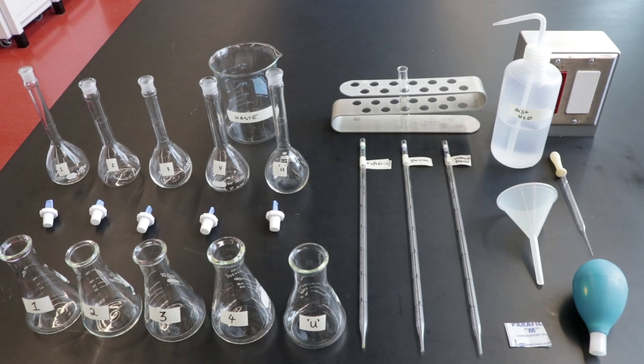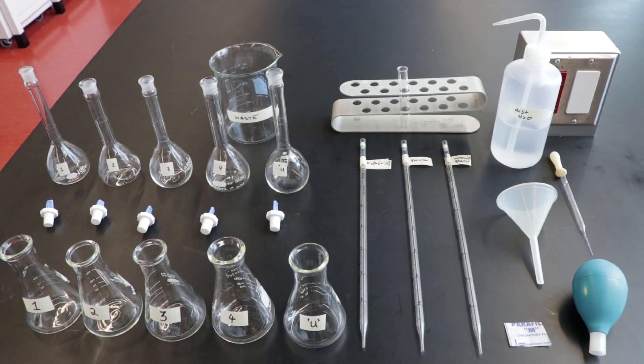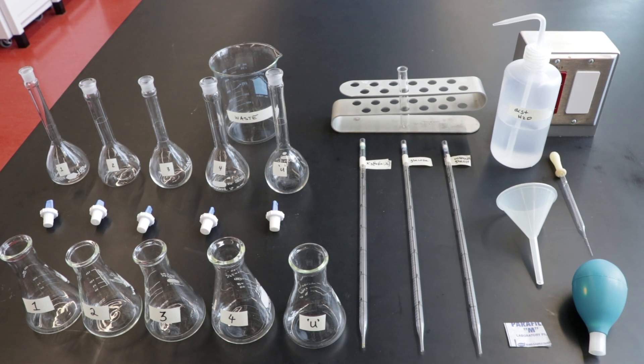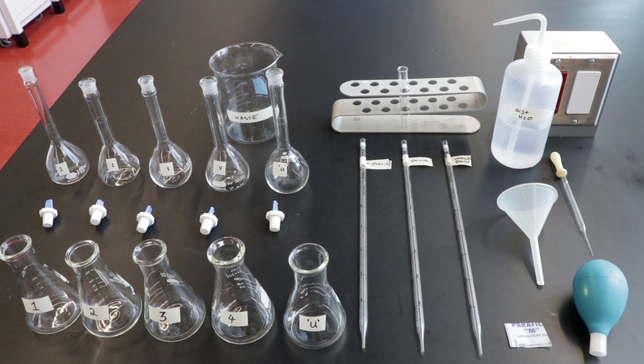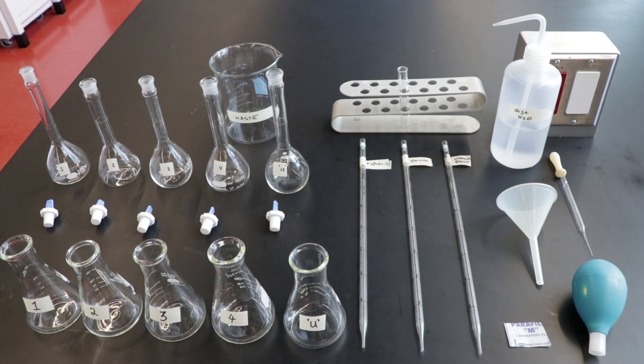Here's the equipment needed for this lab. Label all the glassware to ensure that you are organized. The Erlenmeyer and volumetric flasks should be labeled flask 1, 2, 3, 4, and U for the unknown. The Mohr pipettes should be labeled glucose, ferrocyanide, and unknown glucose.